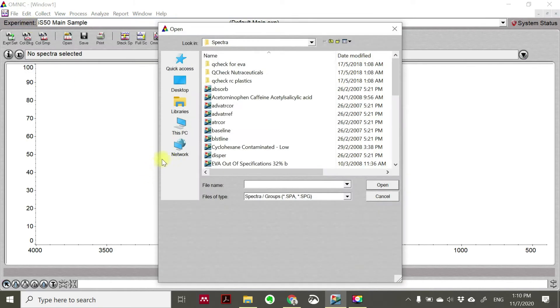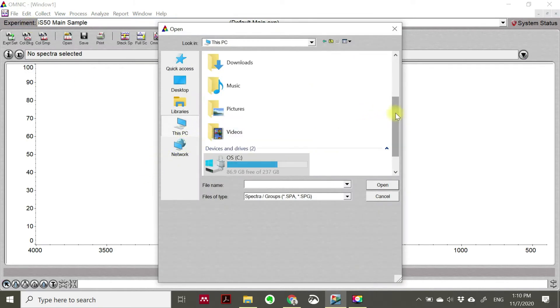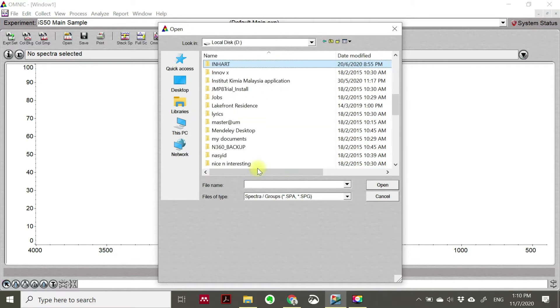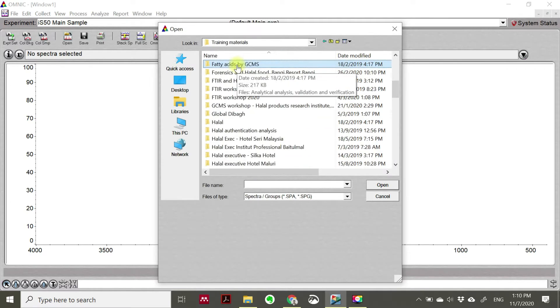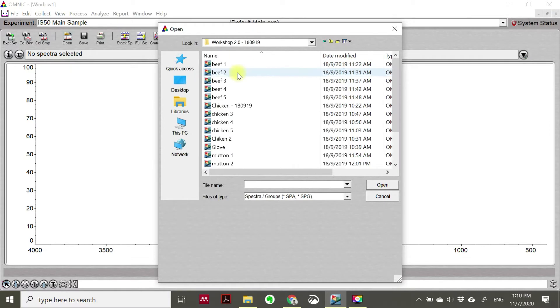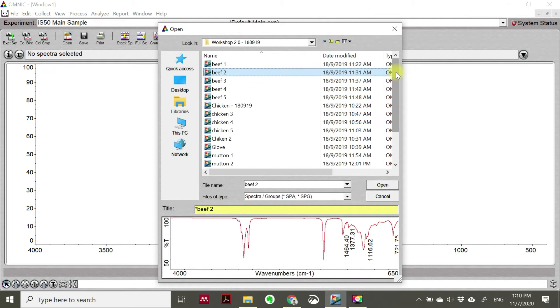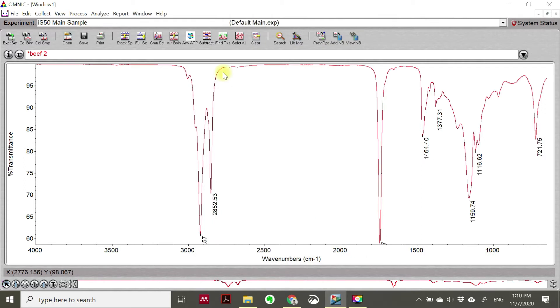So we try to open one data file. This is data about different kinds of oil from different kinds of samples. For example, we have the beef sample here - we try to open this one. In performing data analysis, when you open data from the ATR IR analysis, you will get this kind of spectrum.